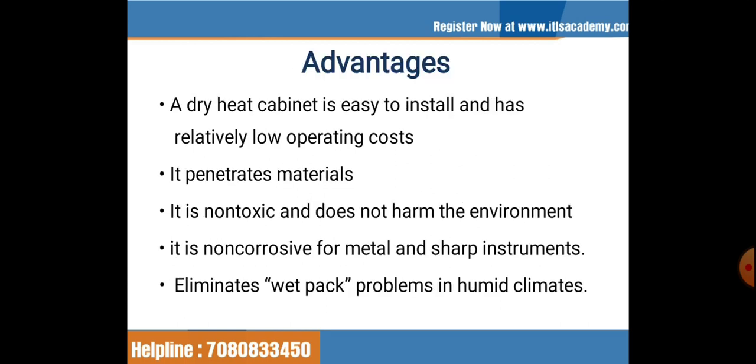Okay, what are the main advantages of using hot air oven? A dry heat cabinet is easy to install and has relatively low operating cost. It penetrates material, that is, whatever the equipments are kept inside it for sterilization, the hot air penetrates the equipments and sterilizes the equipments and materials properly. It is non-toxic and does not harm the environment. It is non-corrosive for metals and sharp instrument. It eliminates wet pack problem in humid climates.